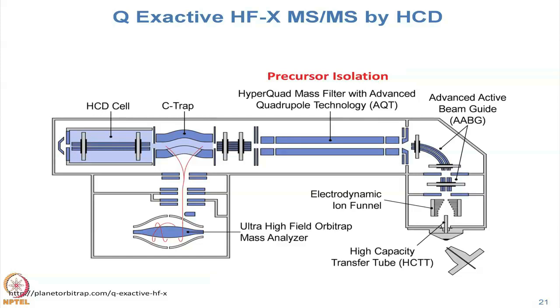So this I think of as today the workhorse type of instrument that if one was setting up a lab to do proteogenomics in the way that we are going to describe having done it in the CPTAC program, this instrument would be the one that one would get today.